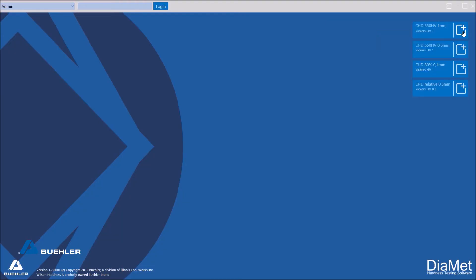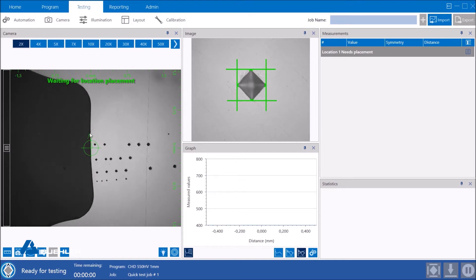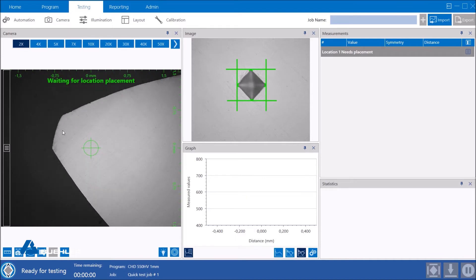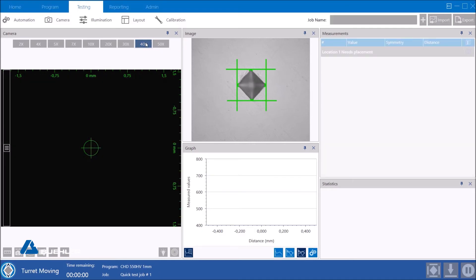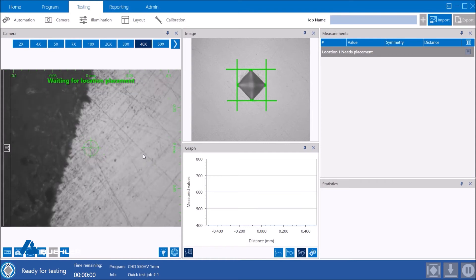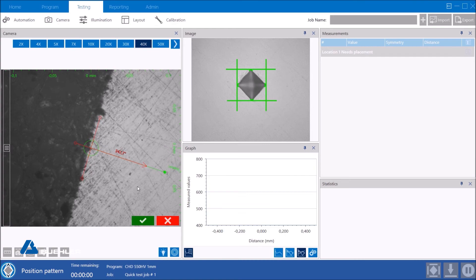DiaMet is our software platform that we use to control our complete range of hardness testers. It was developed with the intent to simplify hardness testing for our operators throughout the world. Setting up a test program is fairly easy to do. Testing, indent measurements, and focusing are all done automatically. The hardness test is finalized by creating a report that we can export as a PDF, Word file, Excel file, text file, and many more options.